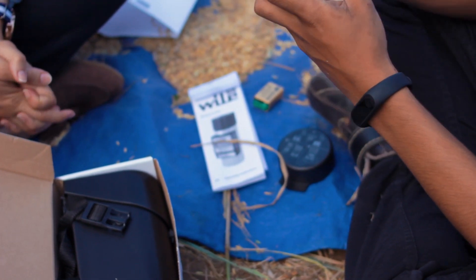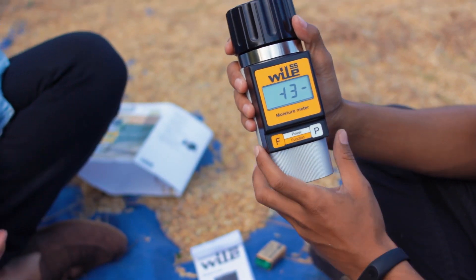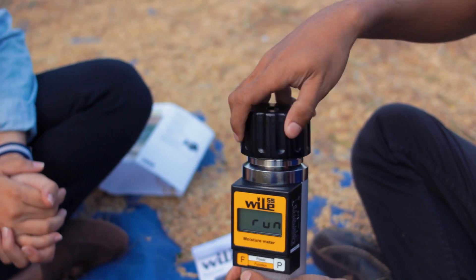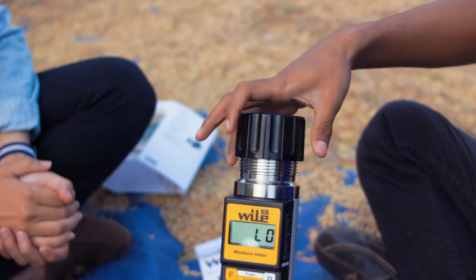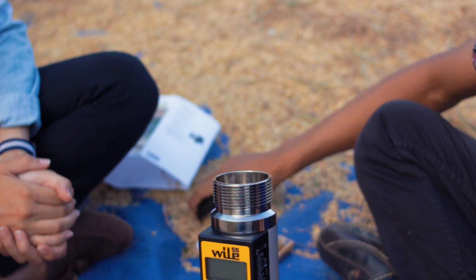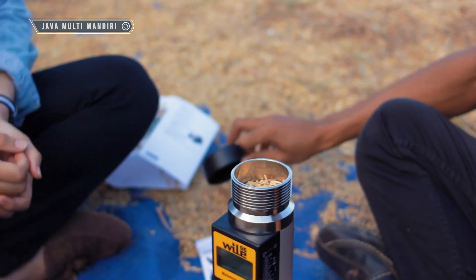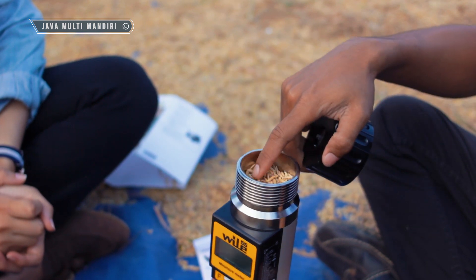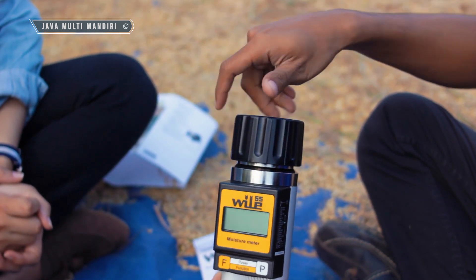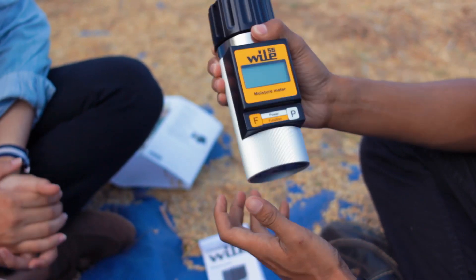Jika alat sudah terpasang baterainya, kemudian kita akan nyalakan alatnya. Kita akan masukkan biji gabah. Caranya seperti ini, menggunakan penutup ini. Isi jangan sampai penuh — isilah sampel satu per empat, kemudian pasangkan tutupnya, lalu goyangkan, kemudian nyalakan alatnya.